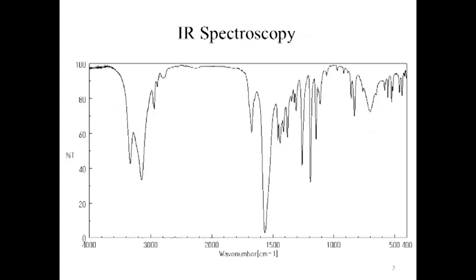I'm not going to lie, this spectra is a bit misleading. So in my first glances at this, I see the sequence of 2 peaks, which typically only shows up for NHs, and in particular, primary NHs. However, if we look at the chemical shift, that's really, really low for an amine. So while I may initially consider that as an amine, I would probably step away from that and say something else, something weird is going on there.